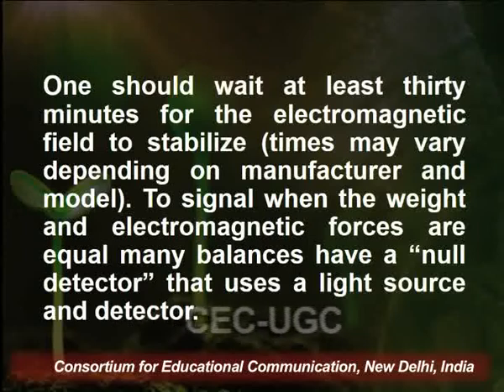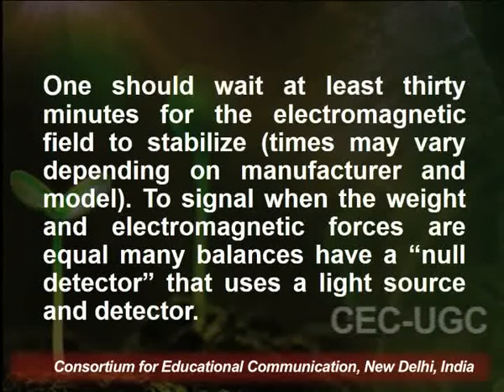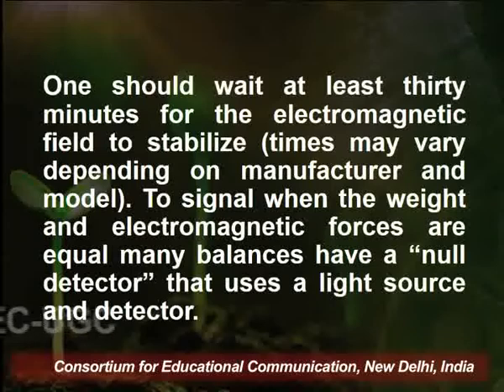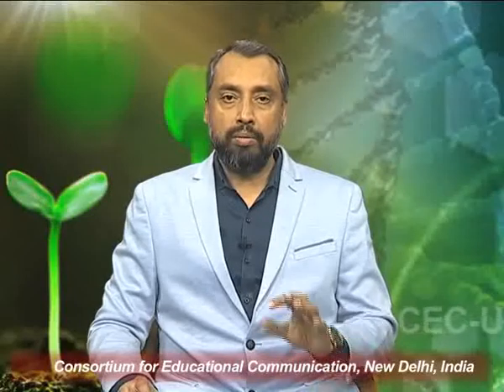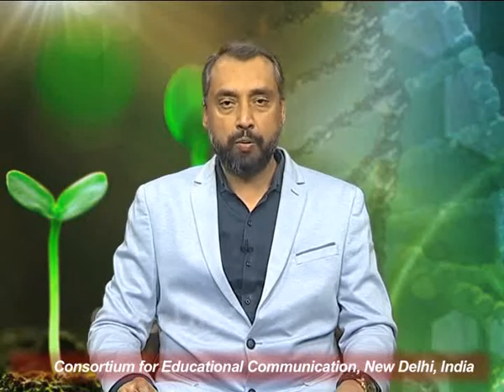To signal when the weight and electromagnetic forces are equal, many balances have a null detector that uses a light source and detector. So by using this electromagnetic servo motor, we detect the force applied by any matter over the balance pan, and it is reflected in terms of digits on a display.